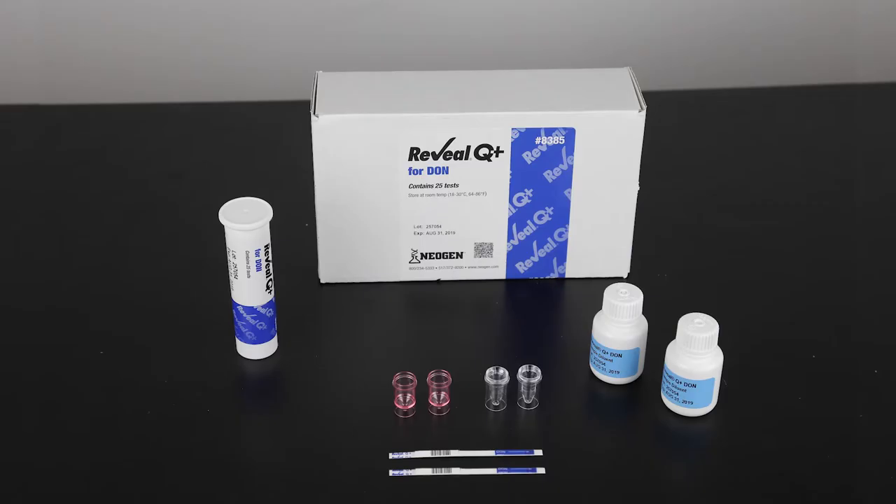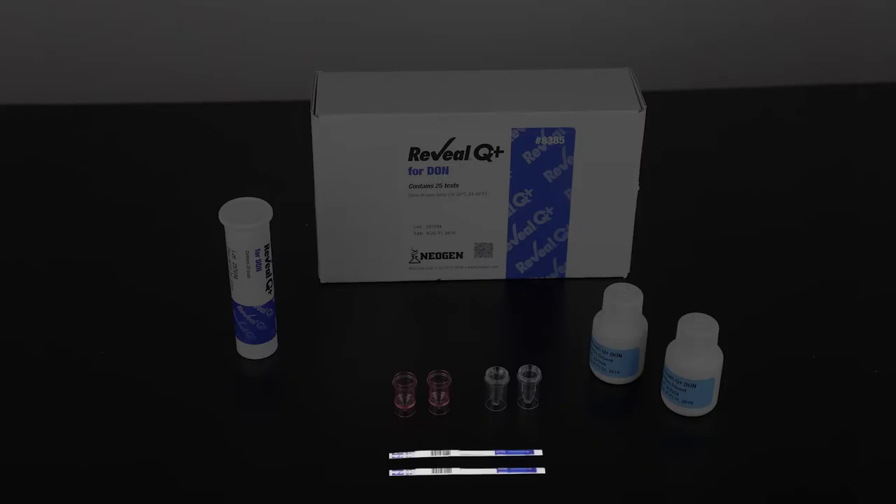Each kit contains supplies to test 25 samples. The kit includes test strips, clear sample cups, red dilution cups, and two bottles of sample diluent.